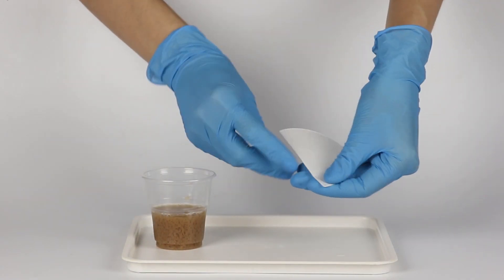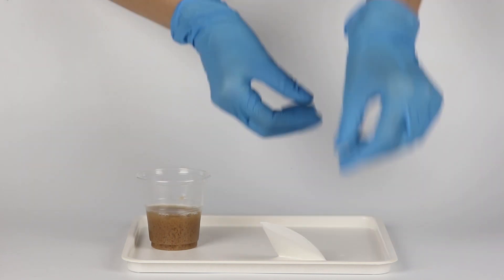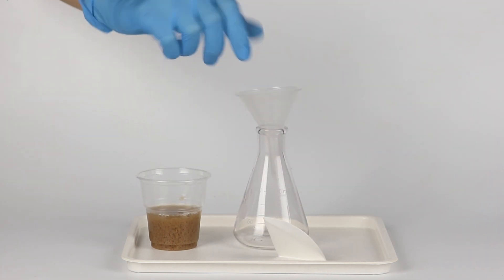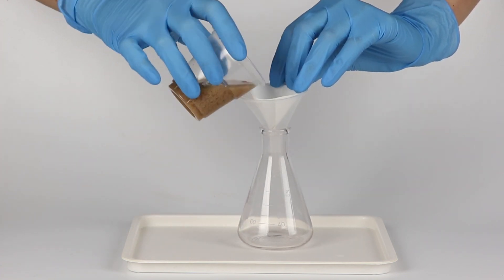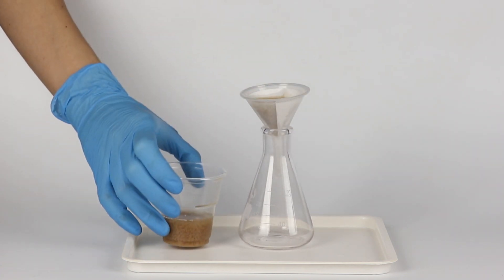Now fold the filter paper as shown here. Put the funnel into the flask and the filter paper into the funnel. Gradually pour the reaction mixture into the funnel to filter out the precipitate.